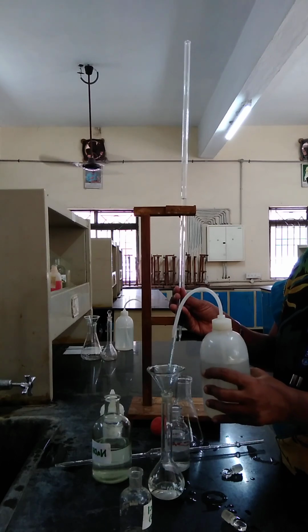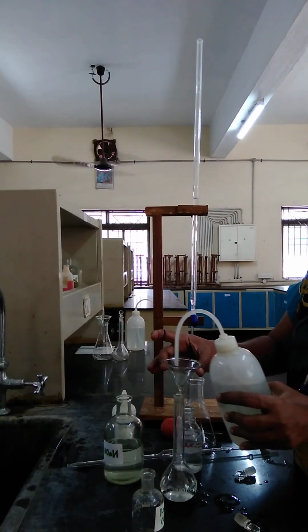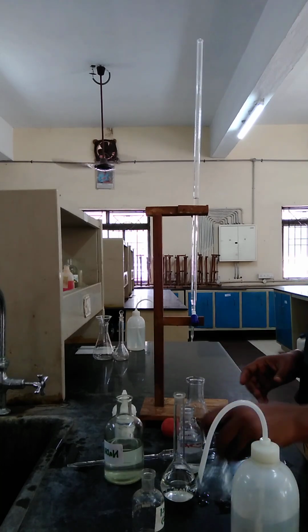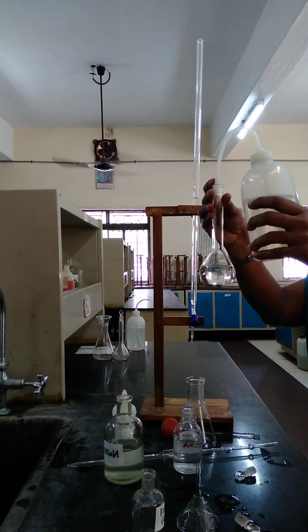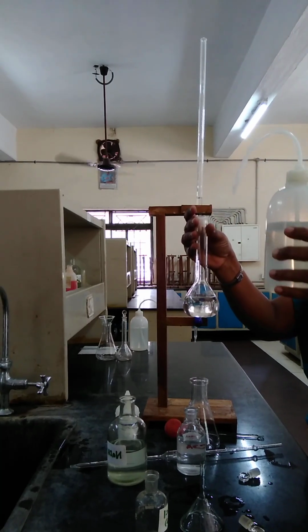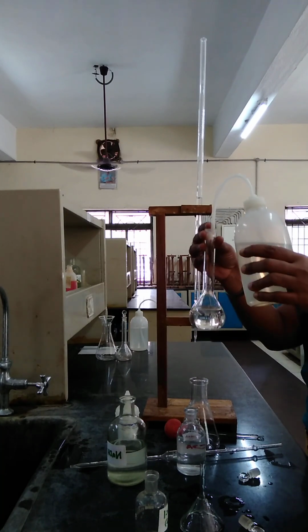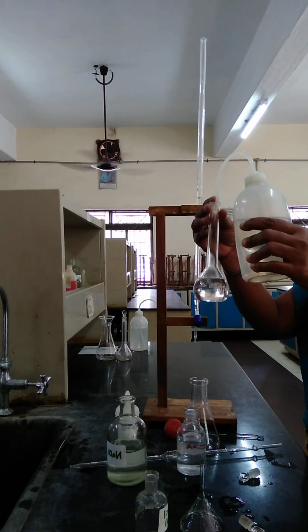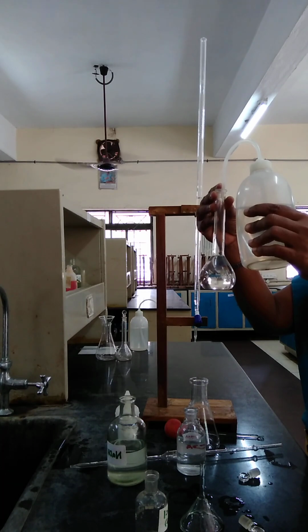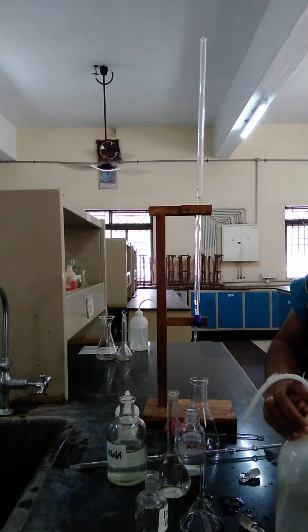Then wash the glass jar and wash the funnel inside. Then you close it and shake very well to homogenize. Don't add the distilled water in a single stage. Close the lid and shake very well to get a homogeneous solution. Afterwards, you add the distilled water. If you add distilled water in a single stage, you won't get a proper homogeneous solution. So you can add it up to the neck.